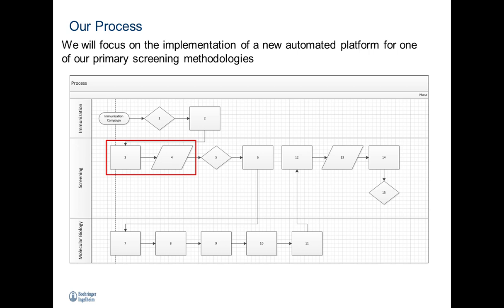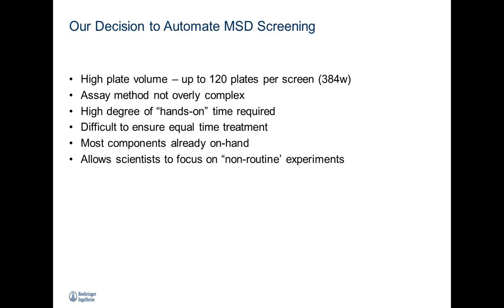As an example, I'm going to focus on the implementation of an automated platform for one of our primary screening methodologies that takes place in the beginning of our process, and that is MSD. The reason that we decided to create an automation platform around the MSD was several-fold.